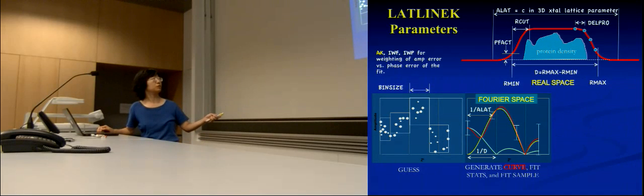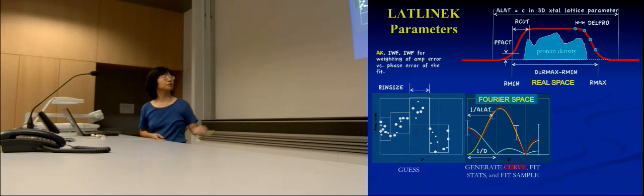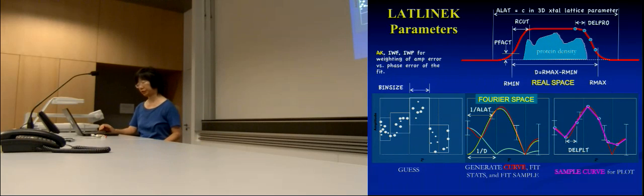using the guess value, and then do the nonlinear least square fitting. So we don't need to know in detail how they did it, but you will have data points, and you can compare that with your measurement. Then you fix that, then you get the value in there. Okay. And the last part of the parameters is just for sampling the curve. Okay. So everywhere where I put some numbers here, there will be a parameter in that particular program to deal with it.